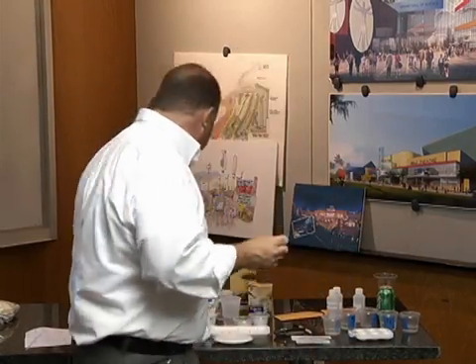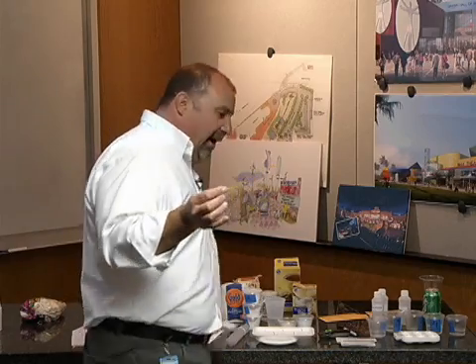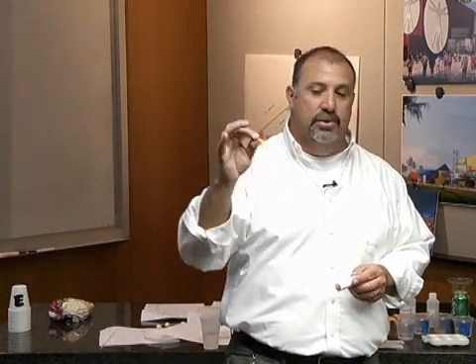The way this works is we will take our water, for example, and if I dip it in there, I pull it out, not much of a color change. And if I put it on here, I can match it to a certain color. You're going to do that with water, and then with a different piece, test the vinegar. So I'm going to give you a few minutes to test these two things, and we're going to see what numbers we get. We're not going to use the chart just yet, but just test them, write them down if you need to, or just remember what you found out. So go ahead and start that, and we'll check back in just a minute.